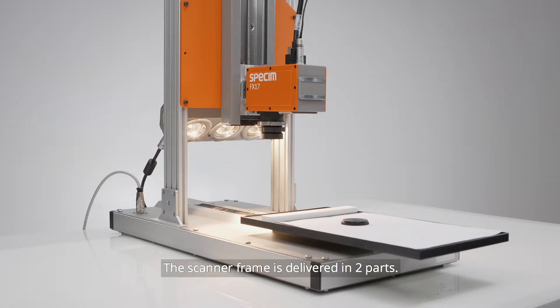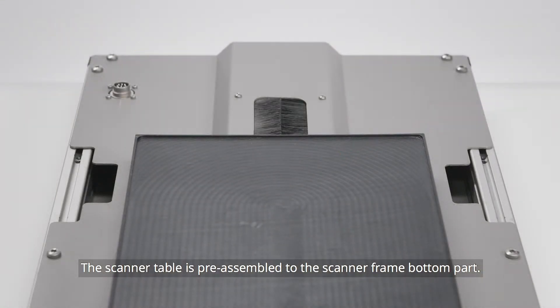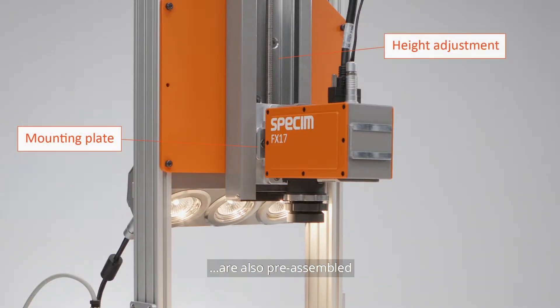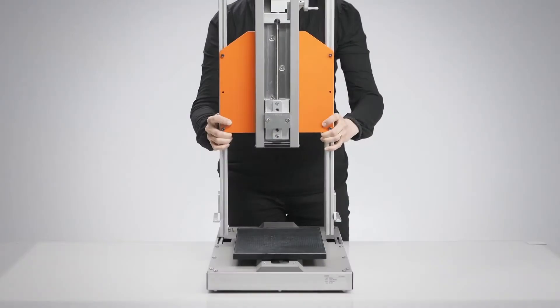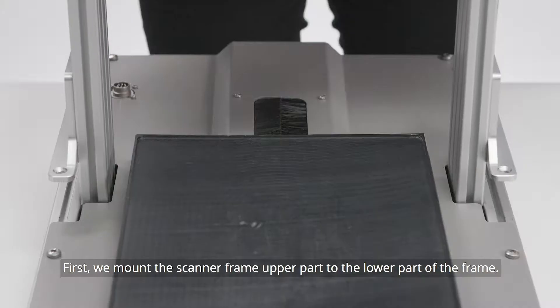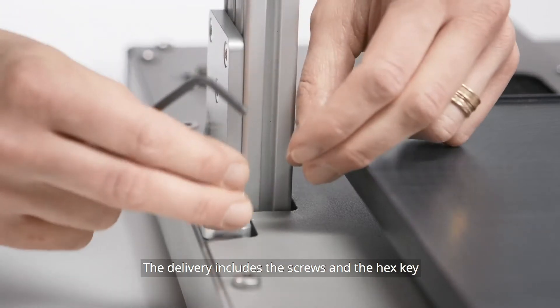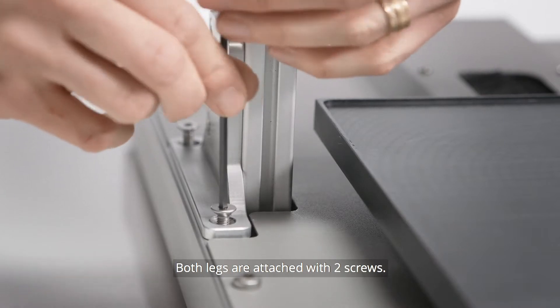The scanner frame is delivered in two parts. The scanner table is readily assembled at the Spec-Im factory to the scanner frame bottom part. The scanner height adjustment and camera mounting plate are also readily assembled at the Spec-Im factory to the scanner frame upper part. First, we mount the scanner frame upper part to the lower part of the frame. The delivery includes the screws and a hex key that are used to tighten up the assembly. Both legs are attached with two screws.